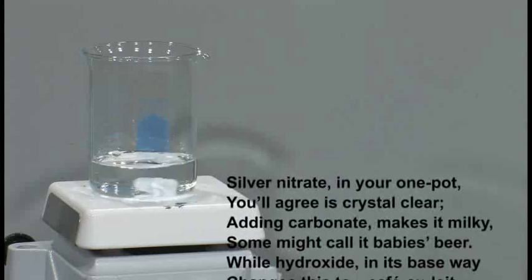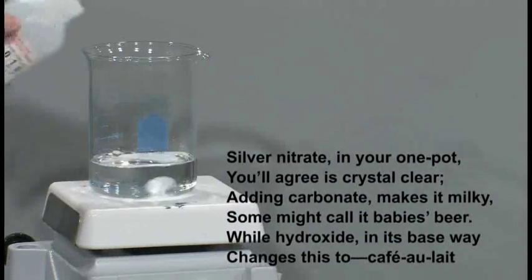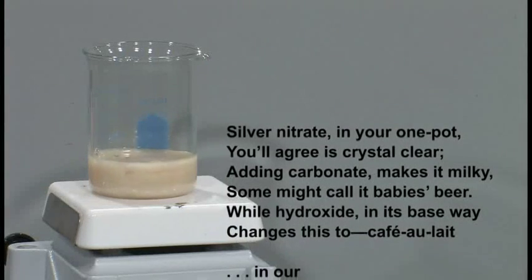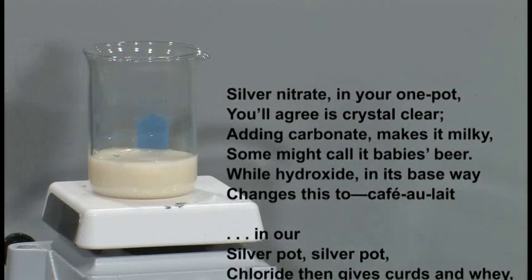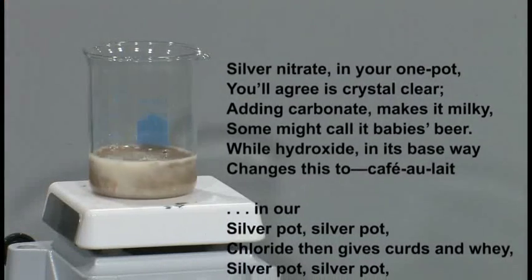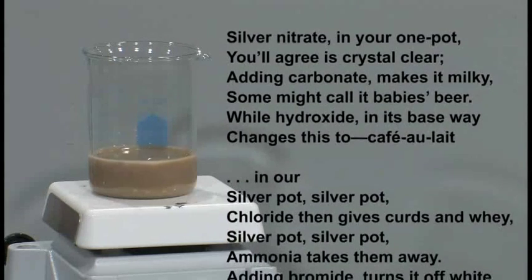Silver nitrate in your one pot, you'll agree is crystal clear. Adding carbonate makes it milky — some might call it baby's beer — while hydroxide in its base way changes this to café au lait.